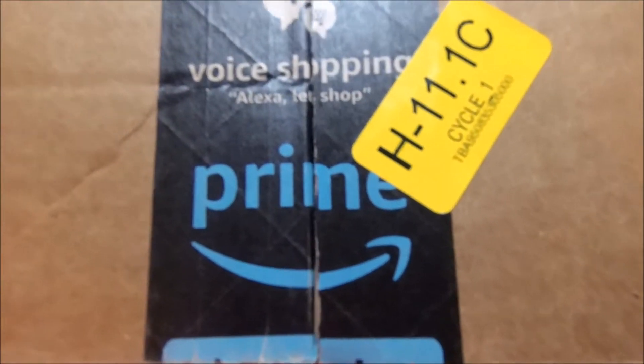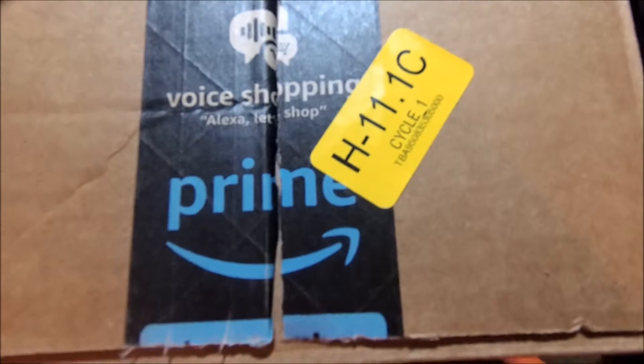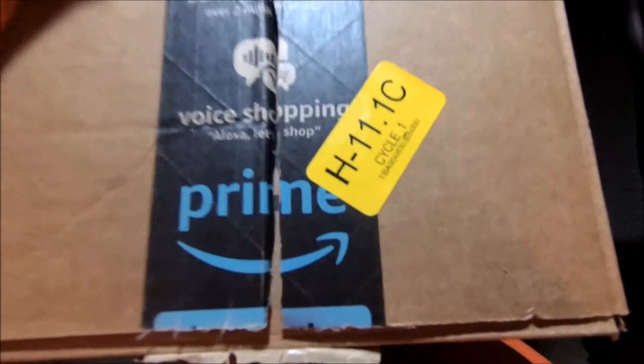Alright my peeps, I'm doing another unboxing, yeah so here we go. Just pre-opened, you know, one hand — see fast, smarter, don't struggle. Alright, so just two items.